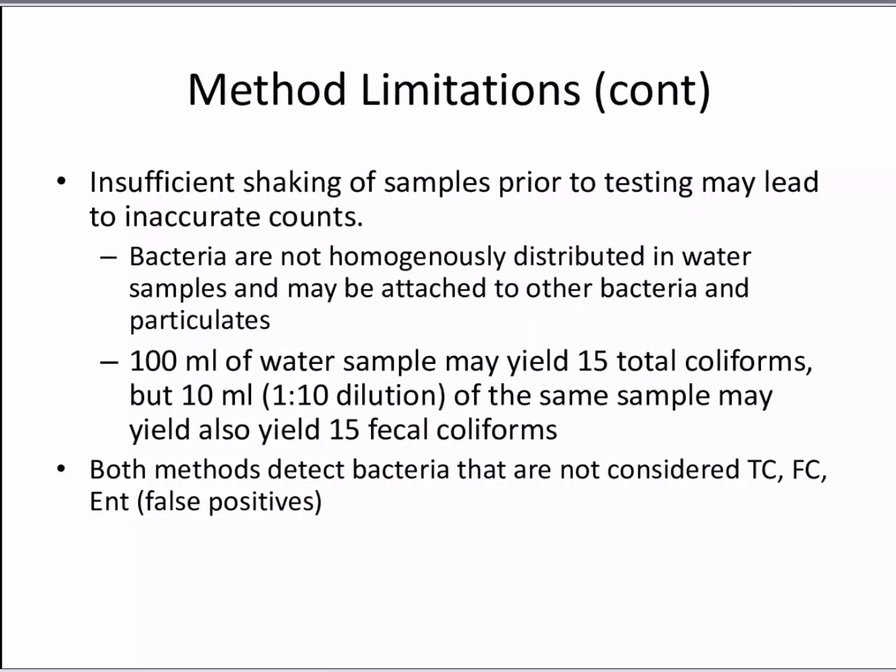Okay, some more limitations. Insufficient shaking of samples prior to testing may lead to inaccurate counts, and this is because the bacteria are not homogeneously distributed in water samples. They may be attached to other bacteria, cells, and particulates, so shaking very vigorously is important.